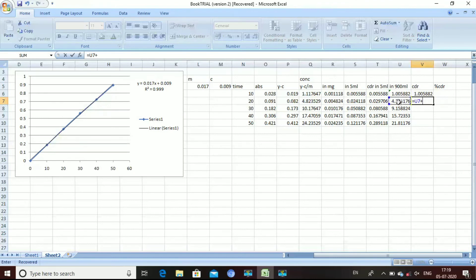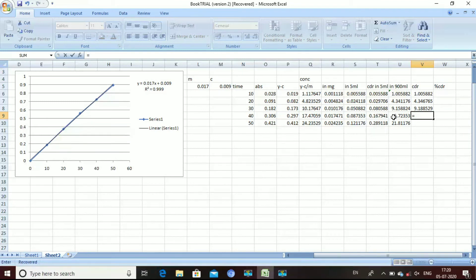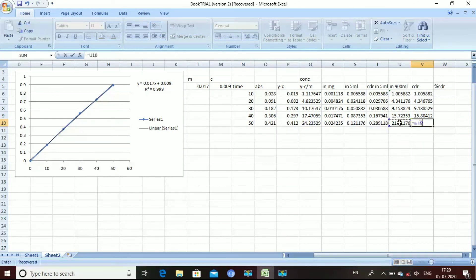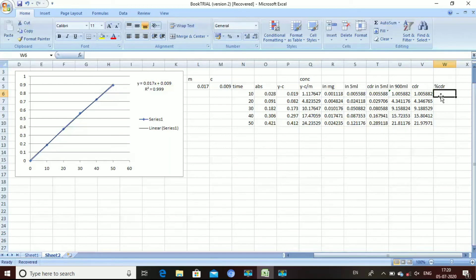For cumulative drug release in 900 mL, enter the first value and press Enter. The next row is the current value in 900 mL plus the cumulative drug release in 5 mL. The last column is percentage cumulative drug release. The cumulative drug release value is divided by the label claim to get the drug release percentage in the formulation, then multiplied by 100.